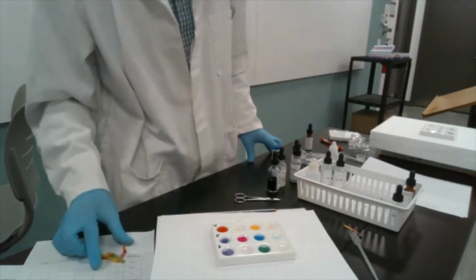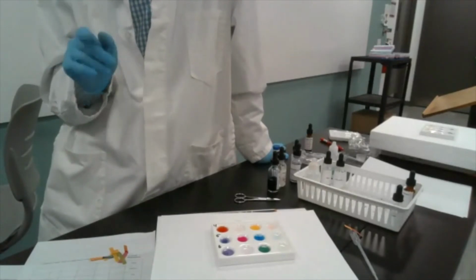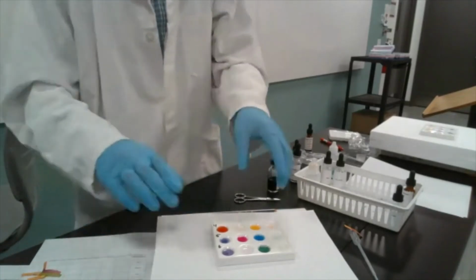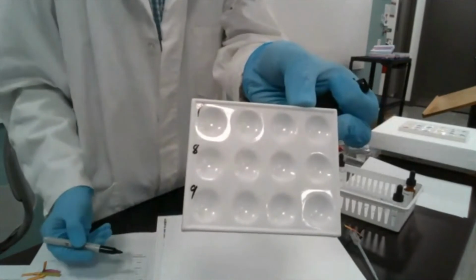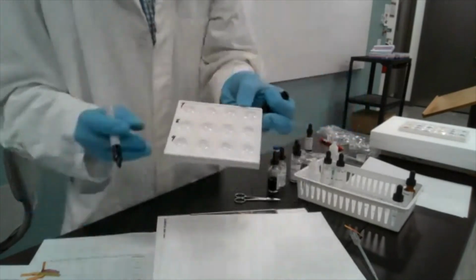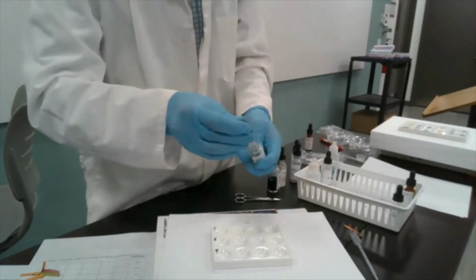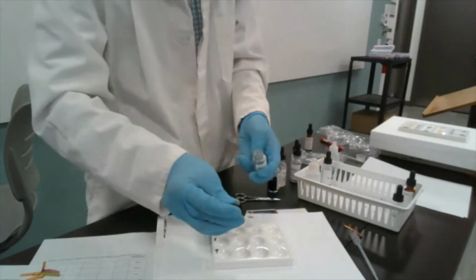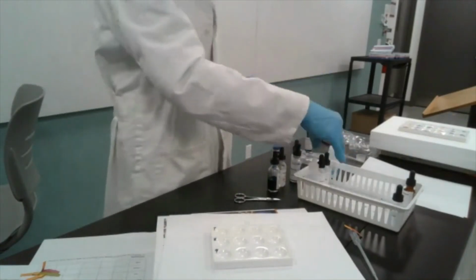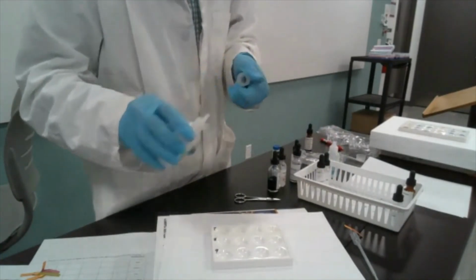Let's see what we have remaining. So we have 3 other interesting substances: pop, vinegar, and milk. Again, some of them you may be familiar with more so than the other. 7 is pop, number 8 is vinegar, and number 9 finally is milk in your table. I just picked something that's colorless and clear as much as possible. Next one is vinegar, also colorless liquid with a strong smell.